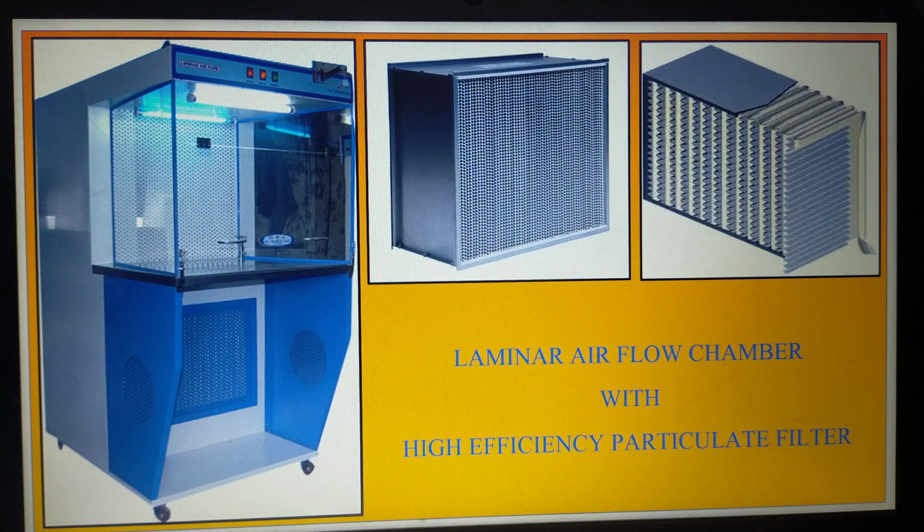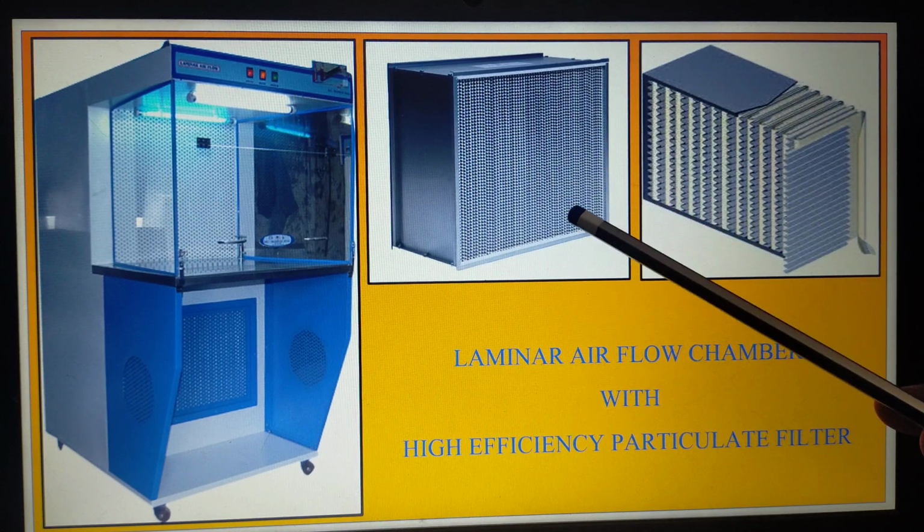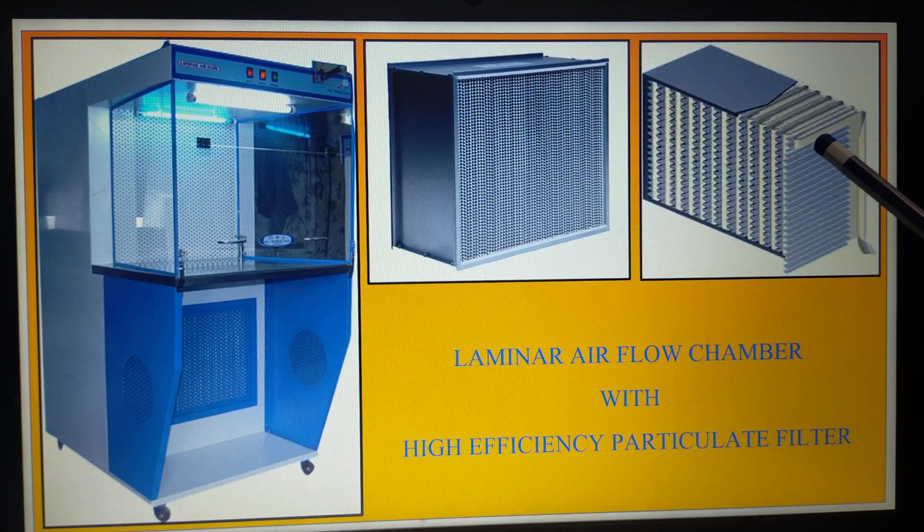This is the internal organization of the HEPA filter. We can see multiple rows of filter papers, right? These filter papers have very fine micropores, so while the air passes through them, whatever dust particles it has get filtered here, right? That is how it works.